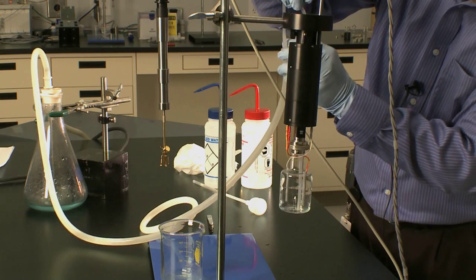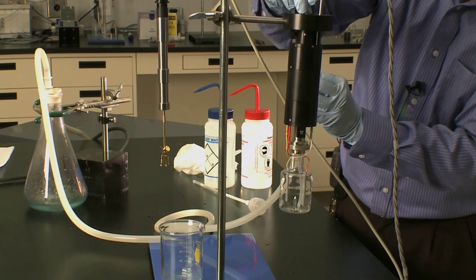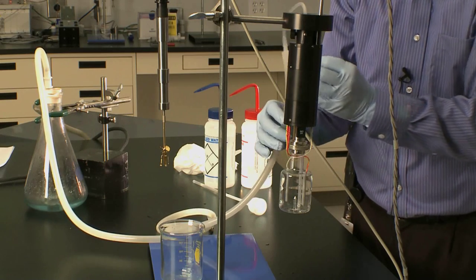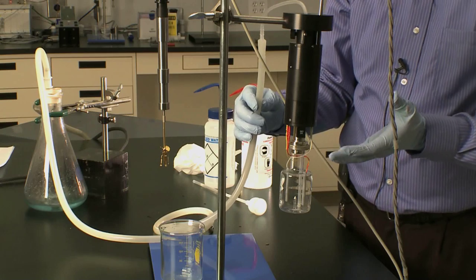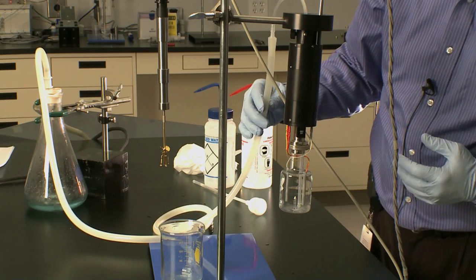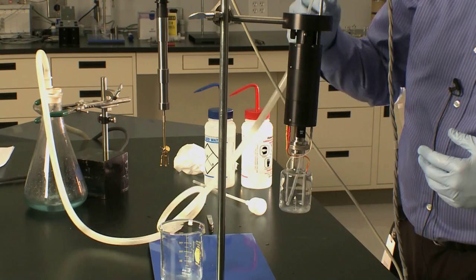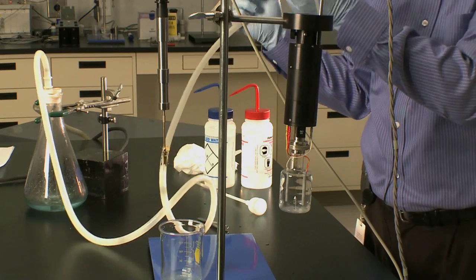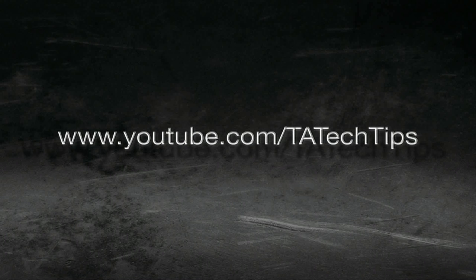Since I have some droplets in there, I'd probably have to do this one or two more times to make sure the vessel is completely dry. You can leave the vacuum run for maybe 30 seconds to a minute to ensure the vessel is completely dry before you're ready to load for the next experiment.